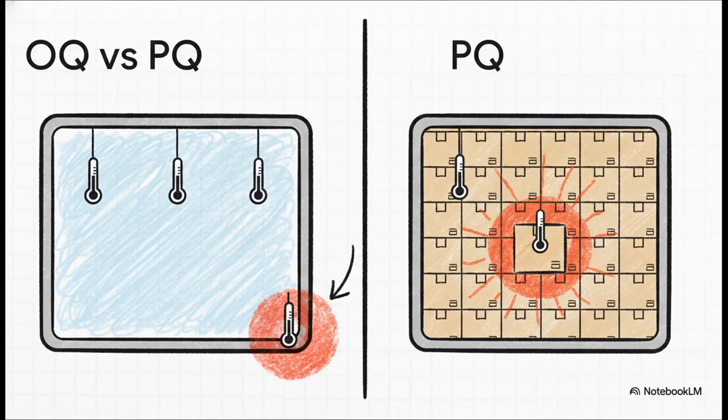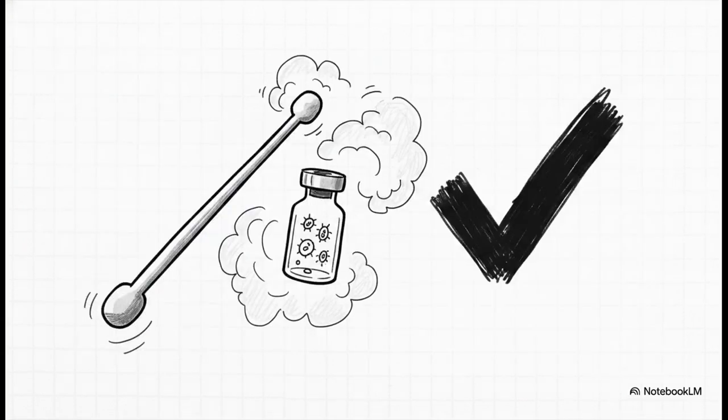So how exactly do we validate this process? Well, the crucial point here is really understanding the difference between your qualifications. OQ, or operational qualification, maps out the empty chamber to find where the machine itself is the coldest. But PQ, performance qualification, maps heat penetration deep inside your actual loaded product. PQ is where you prove, without a doubt, that your target F0 is successfully delivered to the load's absolute slowest to heat point.